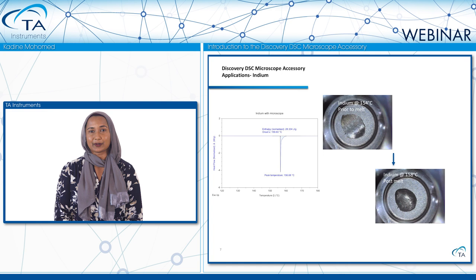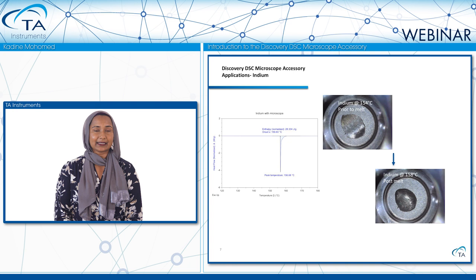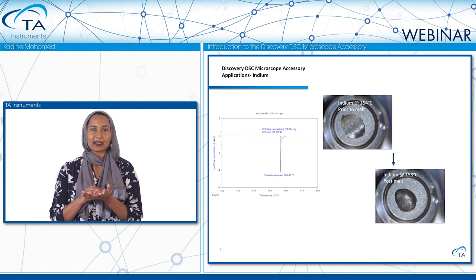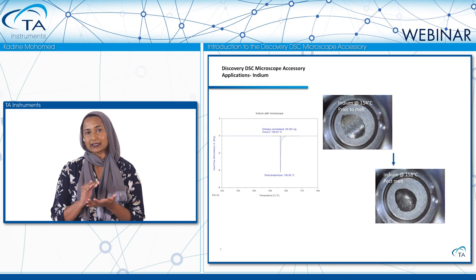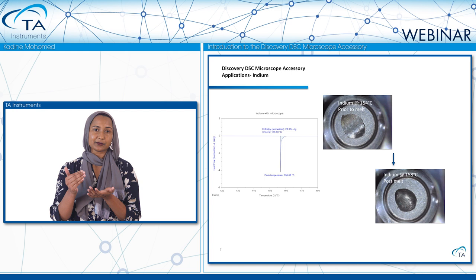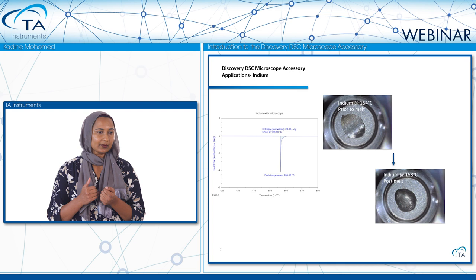The first example is a DSC indium sample. Indium is a metal commonly used to calibrate the instrument for temperature and enthalpy. When preparing an indium sample, it's suggested you cut a very thin slice, position it at the bottom of the pan, and ensure good thermal contact with the DSC pan — because heat must transfer from the sample through the pan to the DSC sensor. We see a very sharp indium melt peak occurring at 156 degrees Celsius.